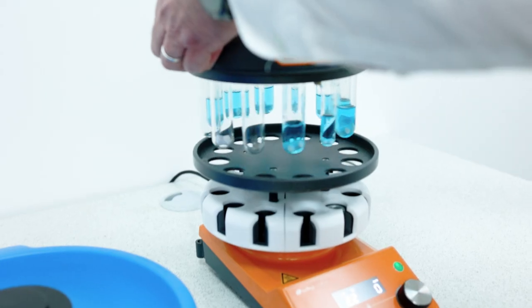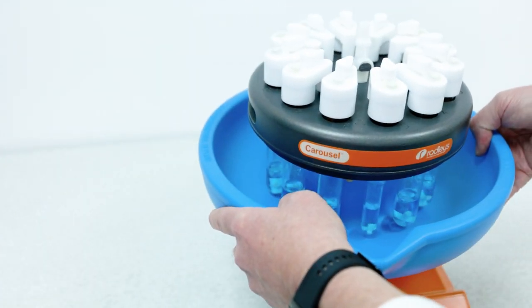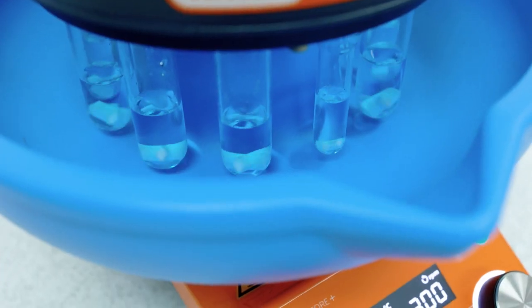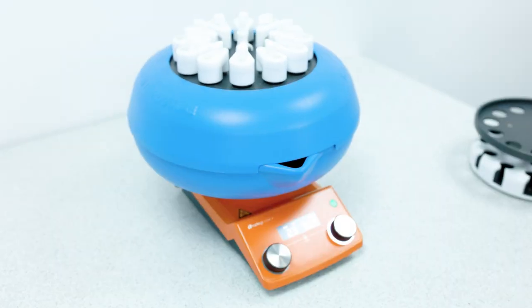Our comprehensive system comes with a cooled option too, so you can rapidly cool and quench your reactions simultaneously. You can expand the range of chemistry you can complete by filling the insulated bowl with a cooling medium, such as water and ice, or dry ice and acetone. You can then place the whole system onto the stirrer hot plate to stir all 12 positions simultaneously.